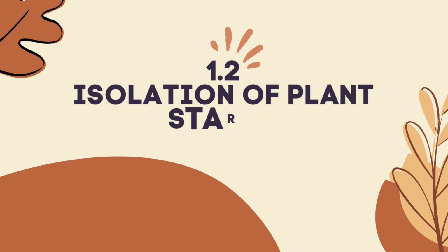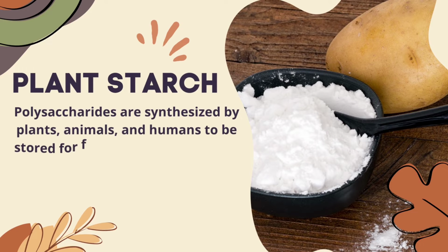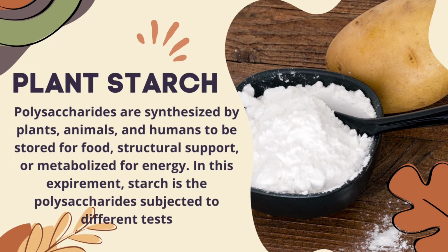The isolation of plant starch. Polysaccharides are synthesized by plants, animals, and humans to be stored for food, structural support, or metabolized for energy. In this experiment, starch is a polysaccharide subjected to different tests.